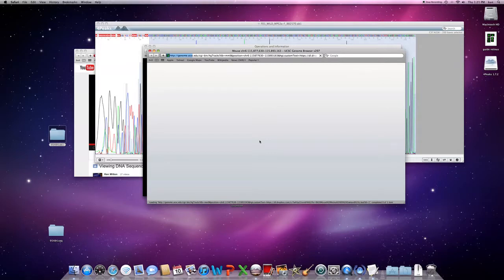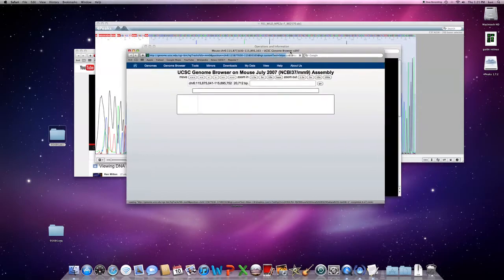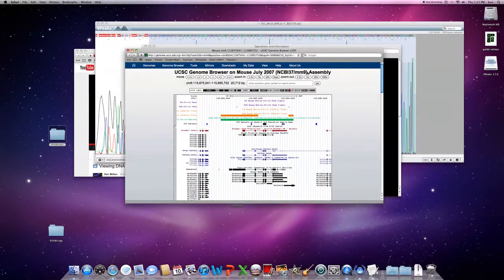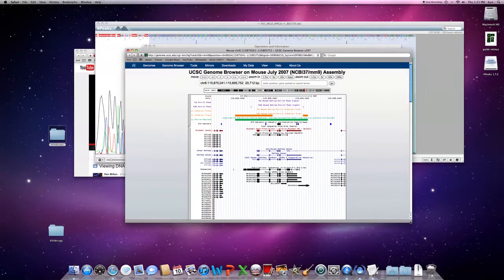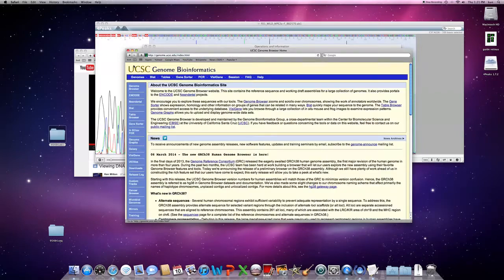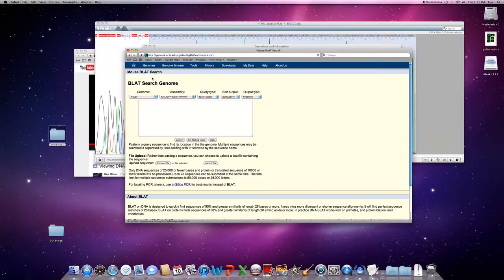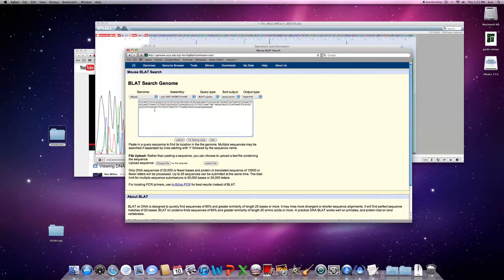This will bring up basically the genome viewer that we can, here it comes now, that we can basically do what's called a BLAT search on. So that's going to be in the 2007 sequence assembly. If you go to the home button, the genome browser, there's a tool called BLAT. It's still on mouse, 2007 build. So I can paste in some of that sequence we just copied.